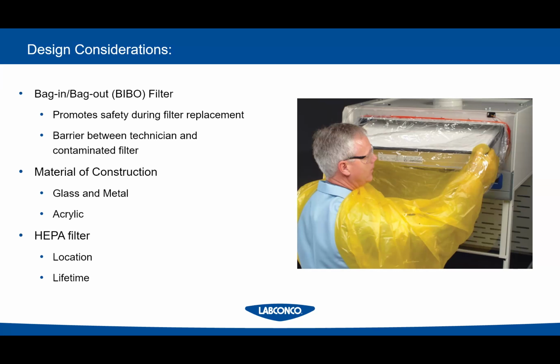Design considerations for this type of enclosure that you should think about. All of our HEPA filtered products that are made for powder or particulate have what's called a bag in, bag out HEPA filter. Why would we need this? Anybody ever change their furnace filter? Little different situation, not what you're going to see when you look at these HEPA filters. But this makes sure that when this HEPA filter is changed, that can be anywhere from 3 years to 10, 12 years after it was installed, that it goes into a bag, it's sealed off. It's just nothing's going to come out of it. So kind of a protective measure for the lab and the certifier that's doing the HEPA filter change at that point. Material of construction. What's it made out of?